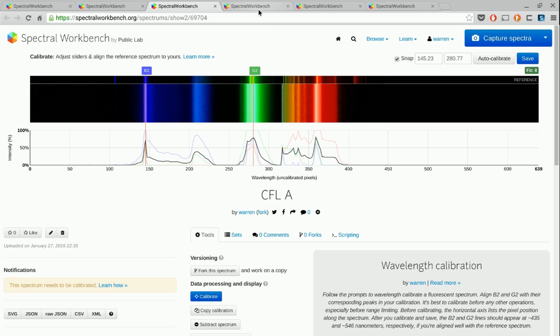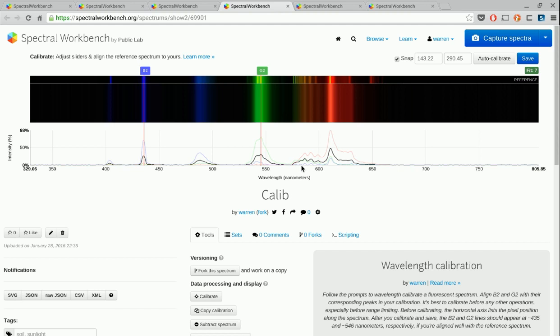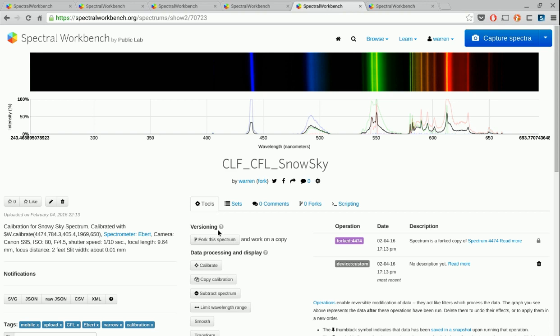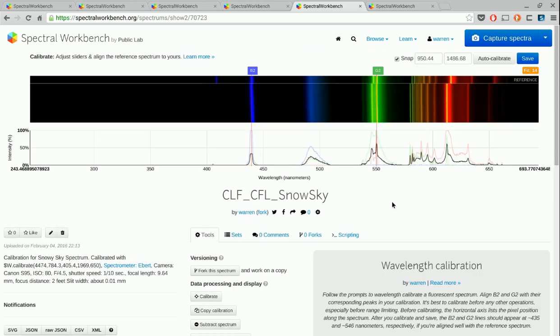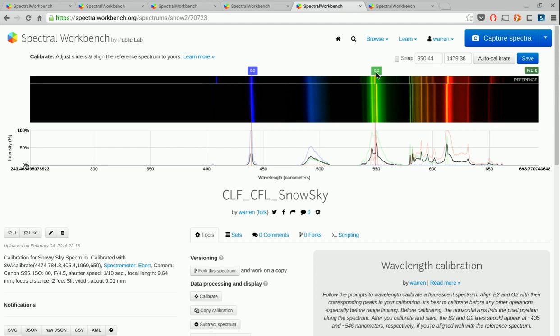The other thing you might notice is that in some of these, not all of the lines line up perfectly. And this is actually the one that our reference was based on, but we've modified it a little bit. And you notice that out here, it doesn't line up that well over by this big red peak. If we wanted to, we could just snap here. But notice that the snapping doesn't let us get really perfectly aligned. Now, let's say we wanted to sort of do a better fit than the algorithm is able to do. And we don't want to snap it perfectly. So if I turn off snapping, notice I can actually get a better fit where not every line is exactly in the right place, but all the lines are closer and no single line is way off. So notice that fit is actually better, a fit of nine than it was in the auto calibrate.